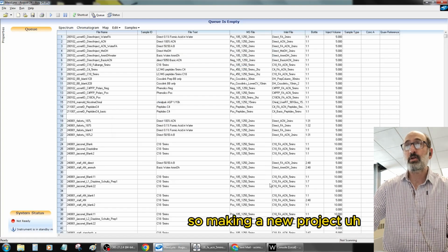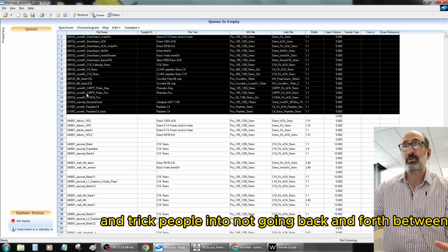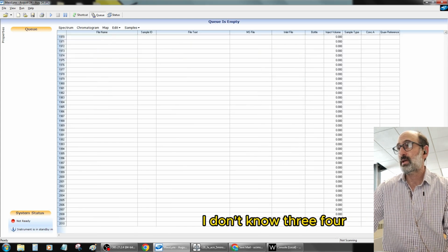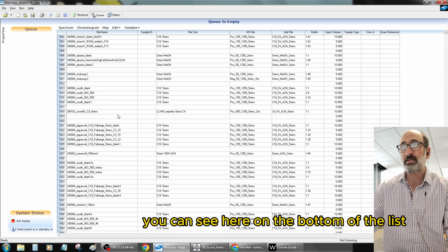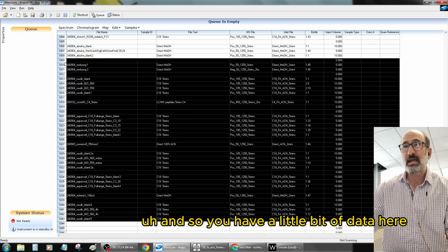Alright, so making a new project. The best way to make a new project and trick people into not going back and forth between the new project and the old project is to wait, I don't know, 3, 4, 5 days into the new month. As you can see here, down at the bottom of the list, I've waited, it's now September 5th, and so you have a little bit of data here.